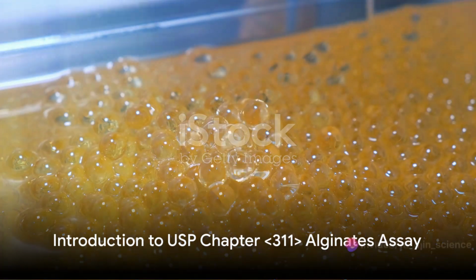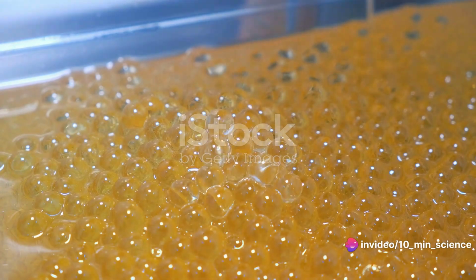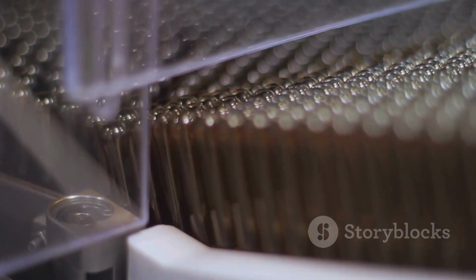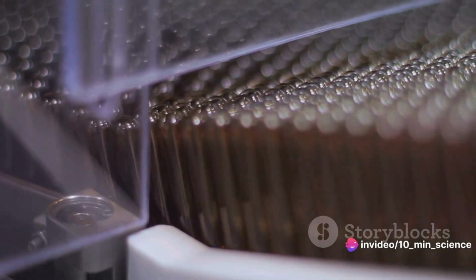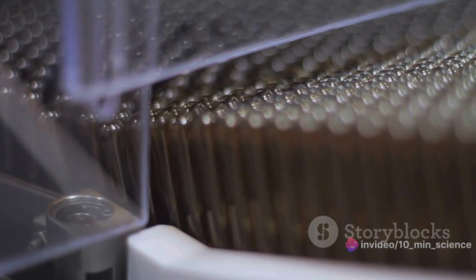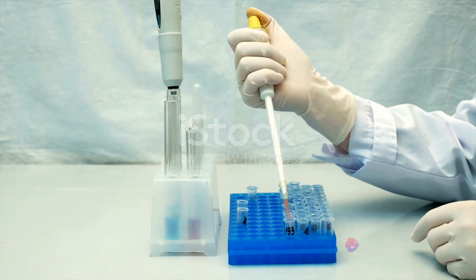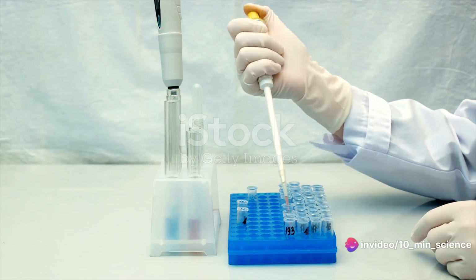Ever wondered how crucial the role of USP chapter <311>, Alginates assay, is in the pharmaceutical industry? Well, it's time to shed some light on this significant process. The USP chapter <311> Alginates assay is a fundamental protocol that validates the quality and efficacy of drugs. It ensures the safety of medicines we consume daily.